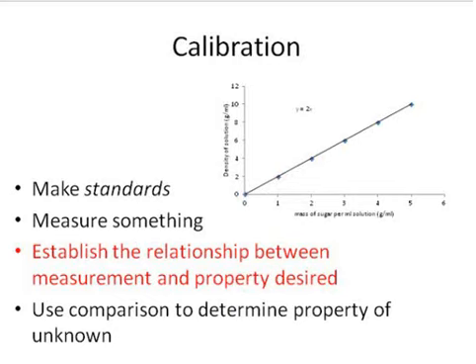So we're talking about a mathematical relationship, an equation that describes the relationship between the property that you're measuring and the known property that you've established for the range of standards. So as an example, I've shown some data here, and the data is plotted in a graphical form, and we will expect you guys to be able to plot graphs, to construct graphs.